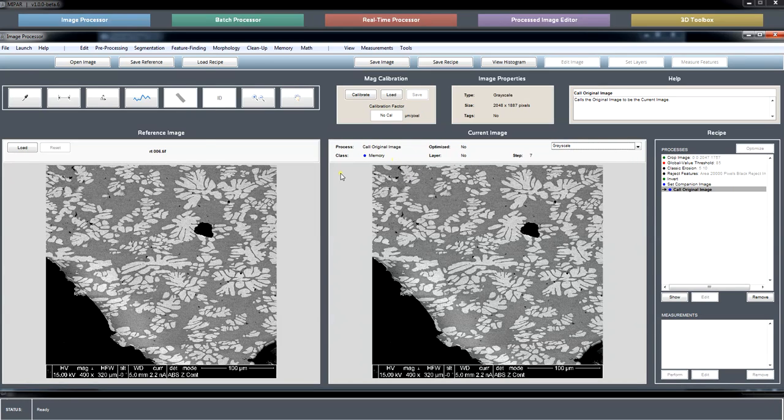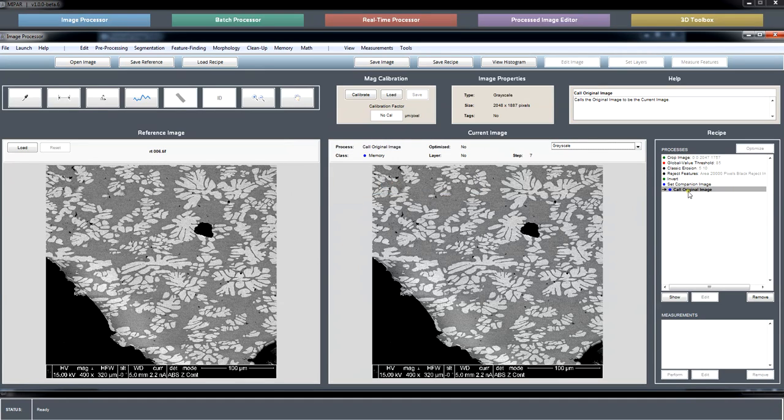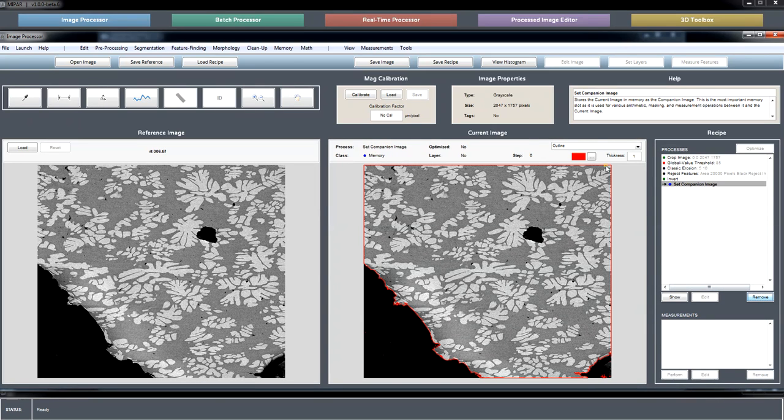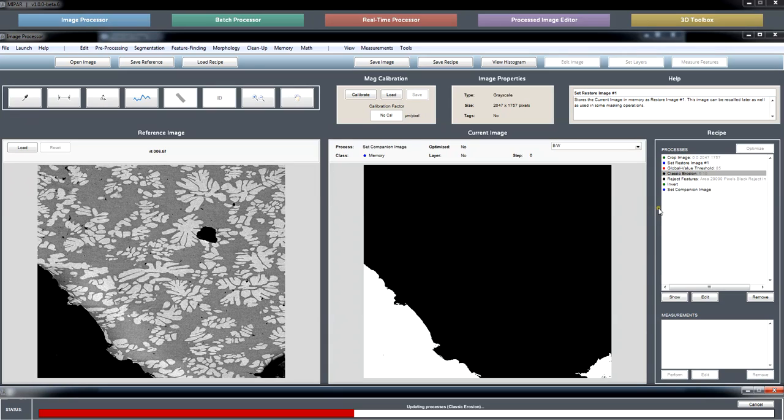Okay, so we've gone back, and probably just a, oh, that's because we've recalled an original image here that is uncropped. So what I want to do is set up a restore image after the crop if you intend to build it into one.